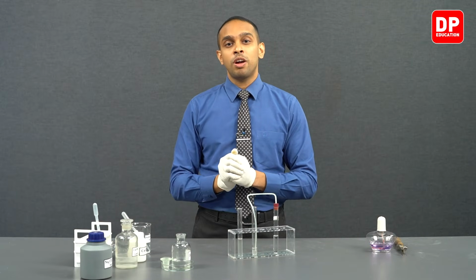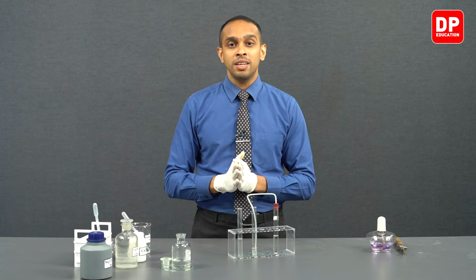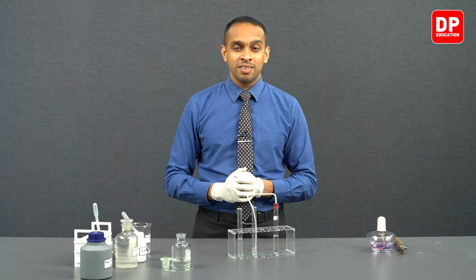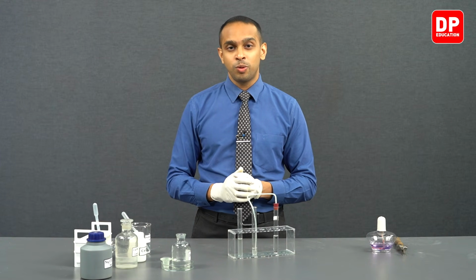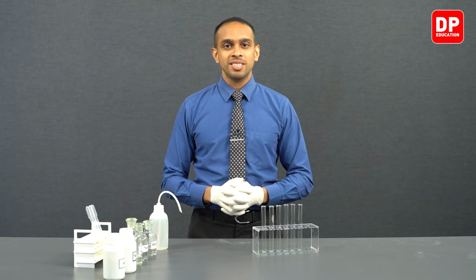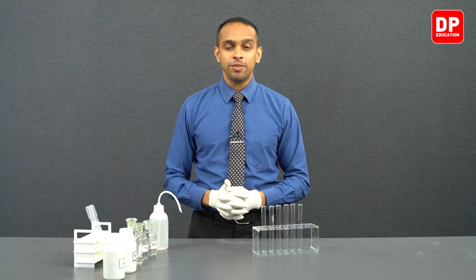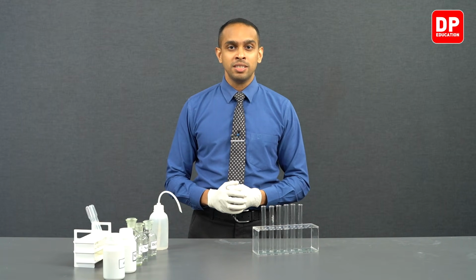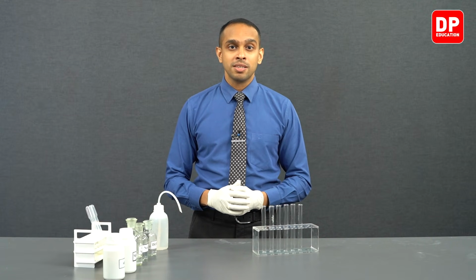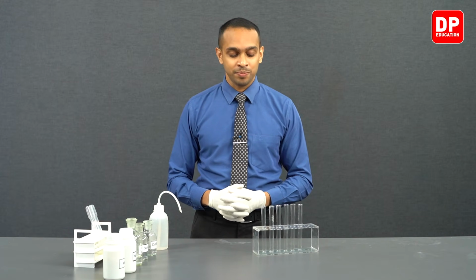So now we have observed the reaction that we can use to identify the presence of carbonate ions as well as carbon dioxide gas. Let's move on to the identification of hydroxide ions. Now students, as an additional experiment, we are going to observe how we can identify the presence of hydroxide ions with the use of aluminium 3+ ions, zinc 2+ ions, or magnesium 2+ ions.